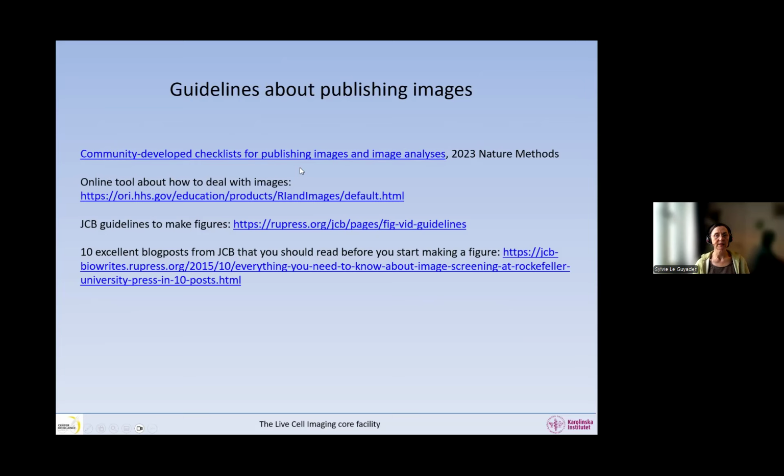I really recommend that when it comes to making your figures and your materials and methods for a publication, you go through this checklist. This is very useful. And as the title says, it's both for making your figures, but also for materials and methods about how the images were acquired and also how to publish image analysis pipelines.